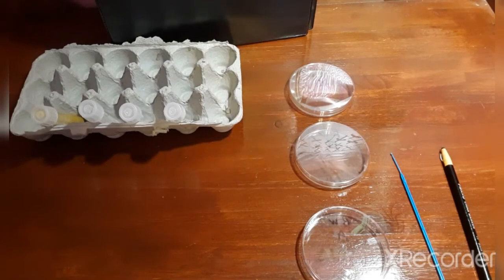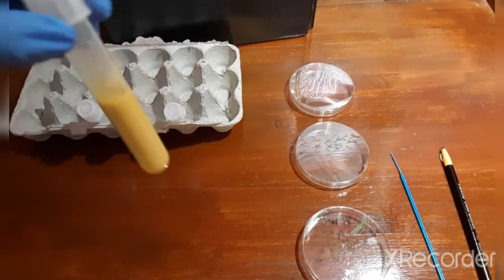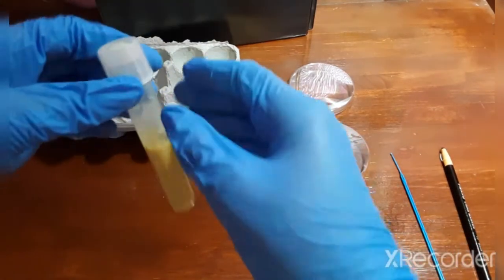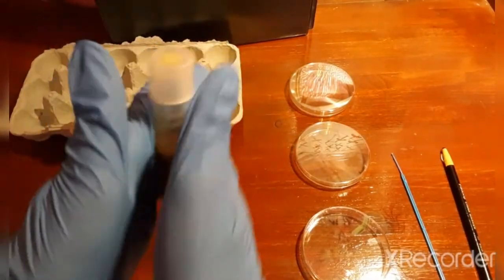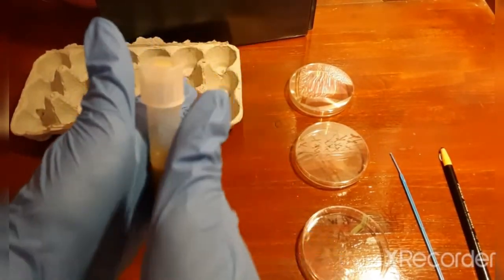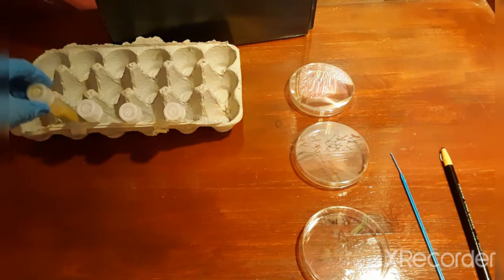Now to begin the real experiment. What you want to do is mix your stock culture — which is this right here — and carefully rotate it or roll it in between the palms of your hands to get a nice mixture of the culture. When you're done, put it back in the test tube rack.